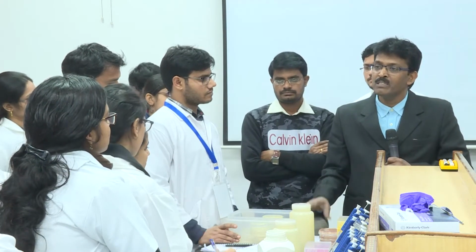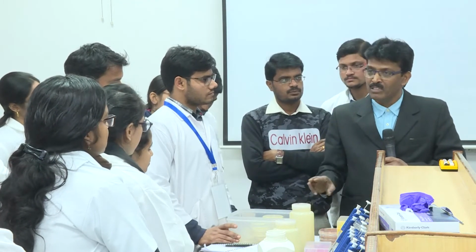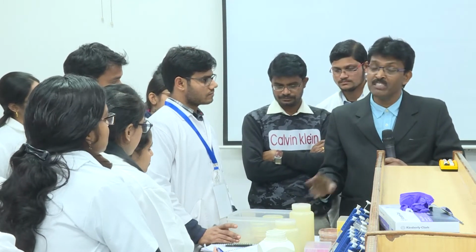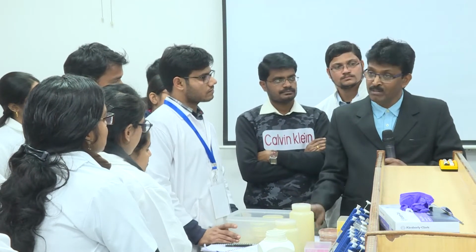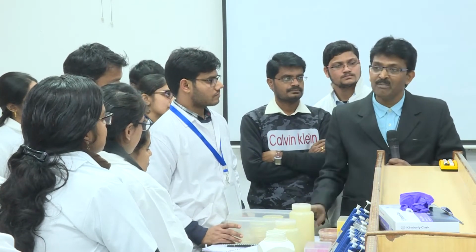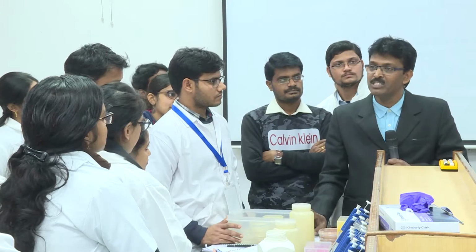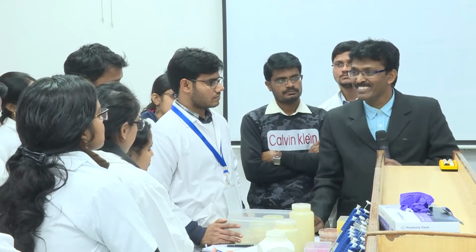Okay. So the pipeline is, you prepare media in the morning, from the autoclave you come to your lab and it is poured right away. If you are not able to come to the lab at the time of the media coming out of your autoclave, we have provisions in the lab. You can keep the media in a molten state for at least 3-4 hours. It never solidifies.